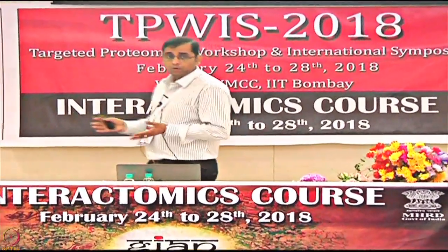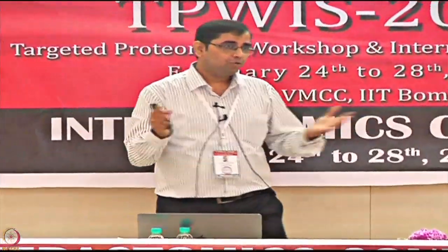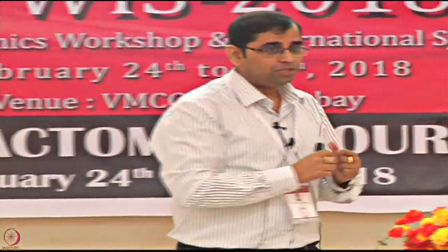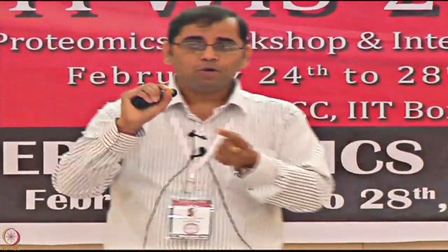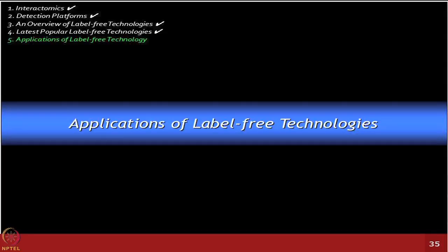So a good thought can be, from the microarray experiments, you have got leads, let's say 200 molecules which are of interest now. You can go to BLI to narrow it down further. Now you can use Biolayer to test how many of those you want to measure the exact on rate and off rate for, right? Okay, so there are many label-free platforms which are possible.